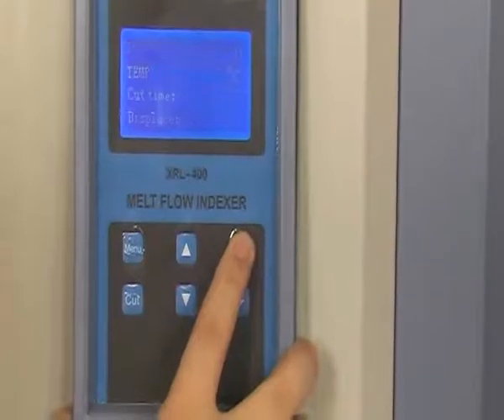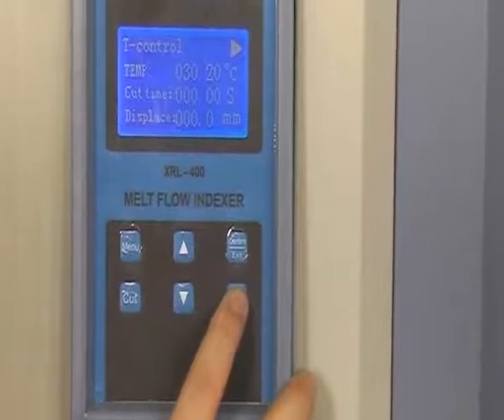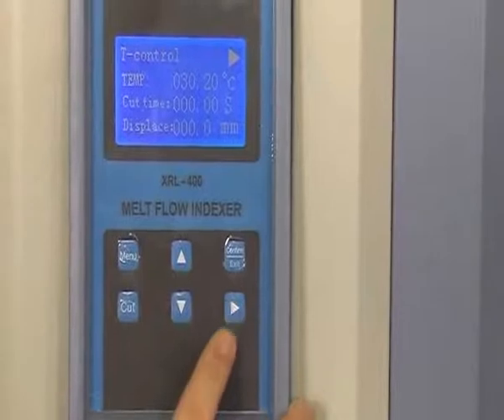After setting the temperature, time, and load, press exit to return to the main interface. Now this right button is on behalf of running the test — press it.